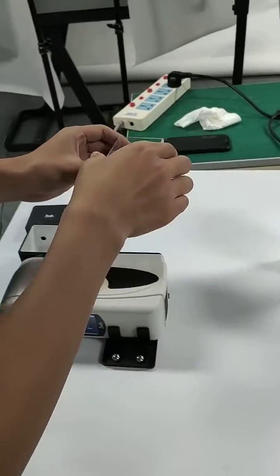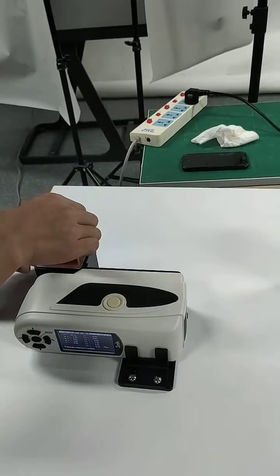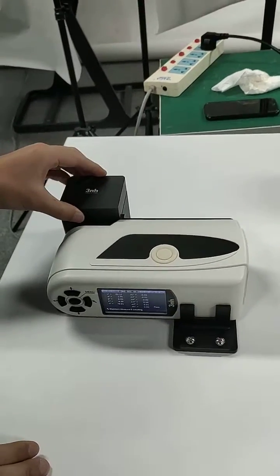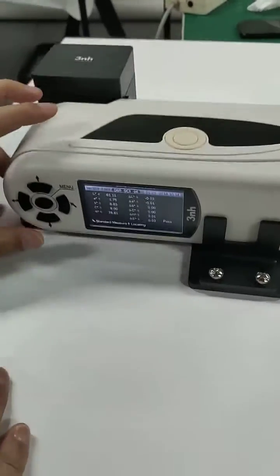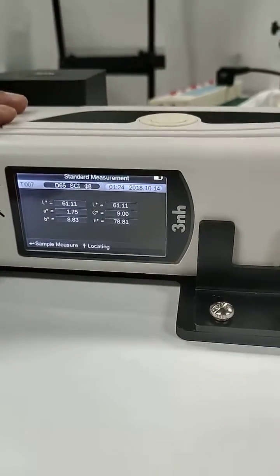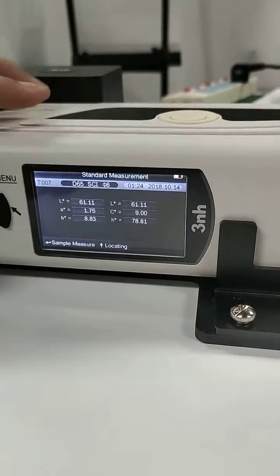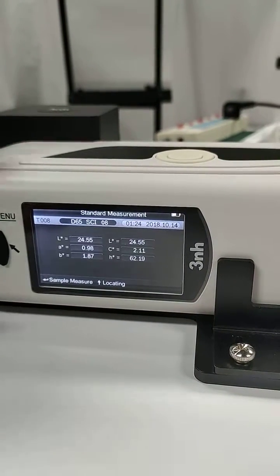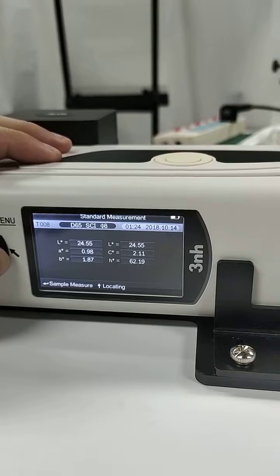Standard measurement — press the button — and then sample measurement.